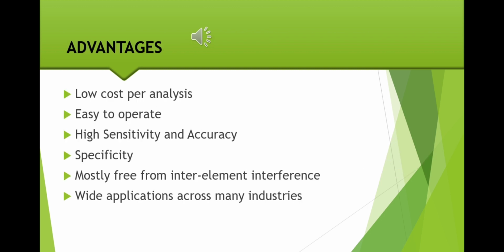Let's discuss the advantages. It is low cost per analysis. It is easy to operate. It has high sensitivity, accuracy, and specificity. It is mostly free from inter-element interference, and it has wide application across many industries.